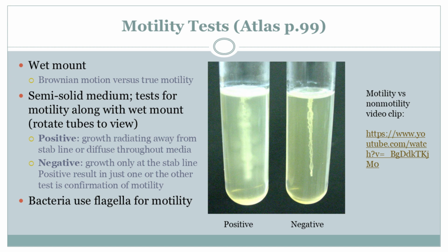So how do scientists even figure that out? I mean, we're talking about something you can barely see under a microscope. Are we attaching tiny little GoPros to them or something? Haha, I wish. Though the technology for that would be incredible. No, we rely on a couple of really cool techniques to figure out if bacteria have what it takes to be called motile. One of the classic methods is the wet mount.